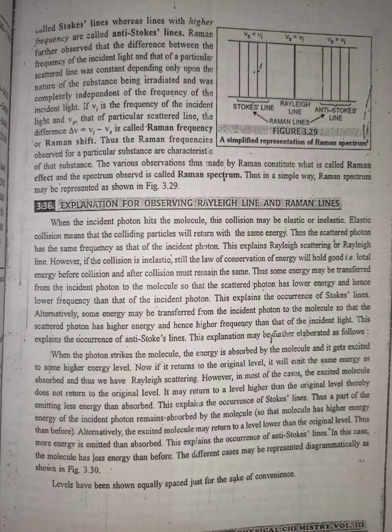When the photon strikes the molecule, the energy is absorbed by the molecule and it gets excited to some higher energy level. Now, if it returns to the original level, it will emit the same energy as absorbed, and thus we have Rayleigh scattering. However, in most of the cases, the excited molecule does not return to the original level. It may return to a level higher than the original level, thereby emitting less energy than absorbed.